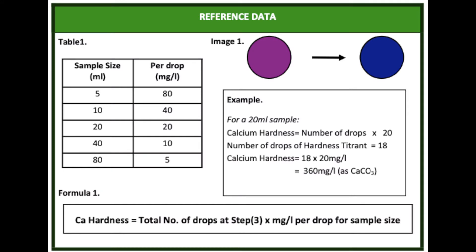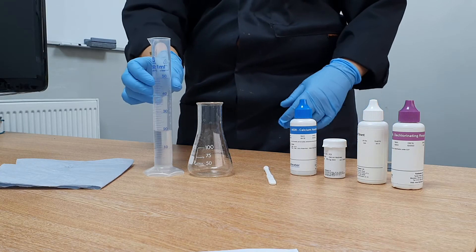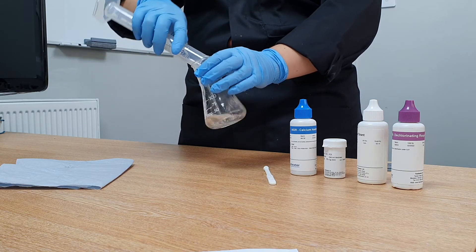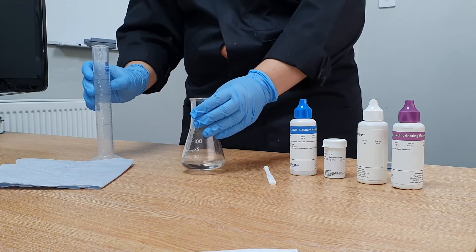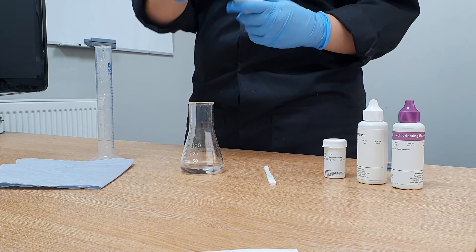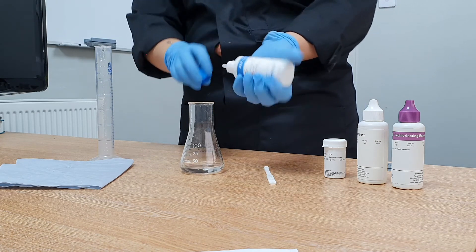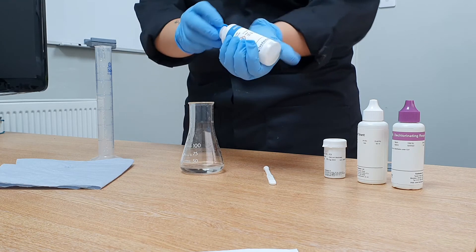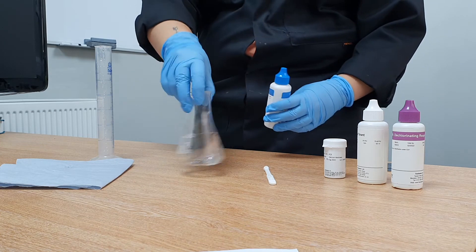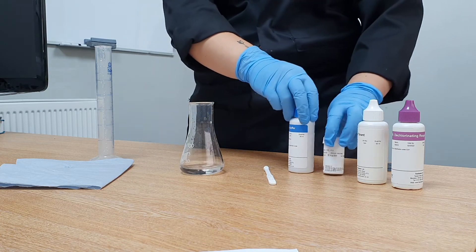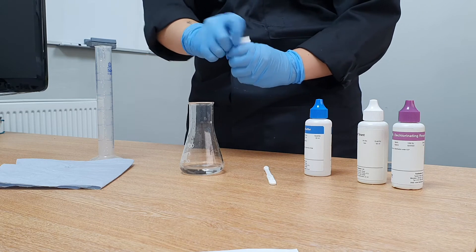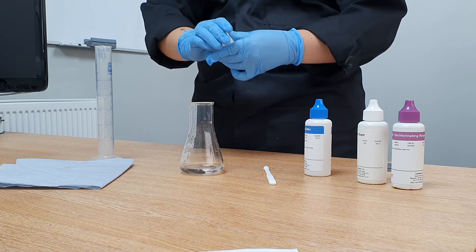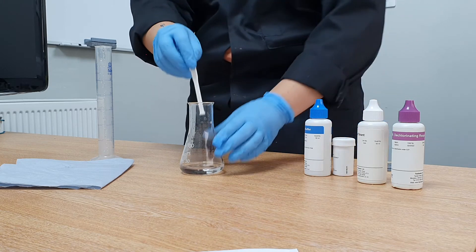Select an appropriate sample size based on the required mg per litre per drop of hardness titrant, and filter the sample if necessary. In this demonstration we will be using a 20ml sample. Add 5 drops of calcium hardness buffer per 20ml sample, and 1 calcium hardness indicator tablet. Crush and swirl to dissolve.